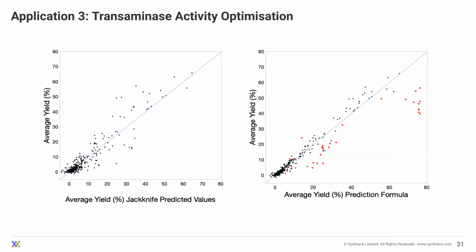So we can see the original actual values against our original model predicted. And then all of the dots in red here were conditions that were predicted by our model that should fit somewhere along this line. So we wanted to predict a whole set of conditions that would sample across our response landscape. And you can see from this one experiment that we got highly detailed models that allowed us to predict what would happen in our system if we were to change one parameter or another.